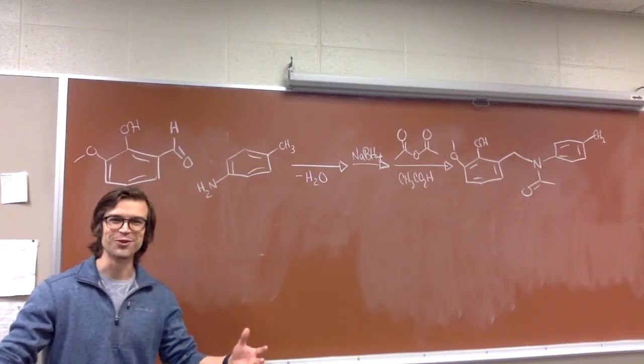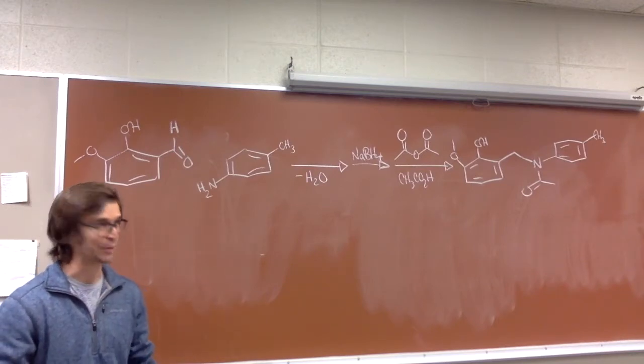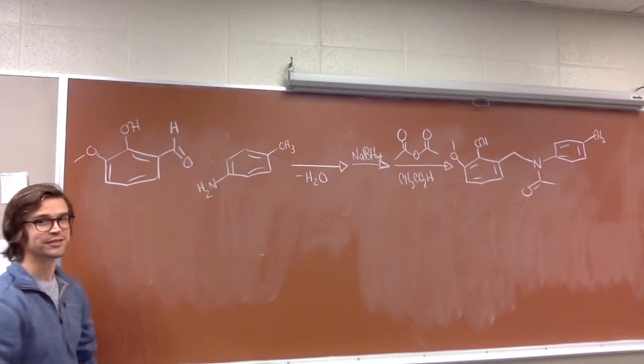Welcome to the first virtual lab. Today we're doing the reductive amination experiment. We're making an amine from these starting materials.